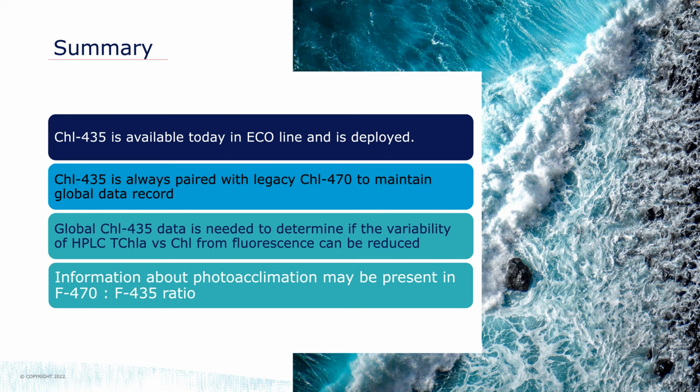And that's one of the parameters in the calibration equation. So when you take the digital counts, the first thing you do is subtract off the dark counts. And those represent essentially the photon noise in our silicon photodetectors. And that probably is the thing that can change more than anything, even the scale factor. And in fact, what Argo floats do is when they're down at 1,000 or 2,000 meters, there's virtually no light. They can do a dark count measurement without obviously needing to be taped over. So that's one thing that you can do. But your fluorometer should be regularly calibrated.